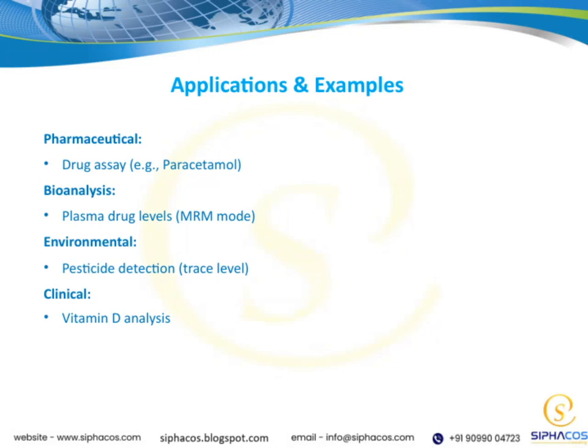Now, let's take a look at some of the key applications and examples where our techniques make a real difference. In the pharmaceutical industry, one common application is drug assay, such as measuring paracetamol levels. This helps ensure proper dosage and safety for patients. Moving on to bioanalysis, a typical example is monitoring plasma drug levels using multiple reaction monitoring, or MRM mode, which provides highly sensitive and specific analysis.